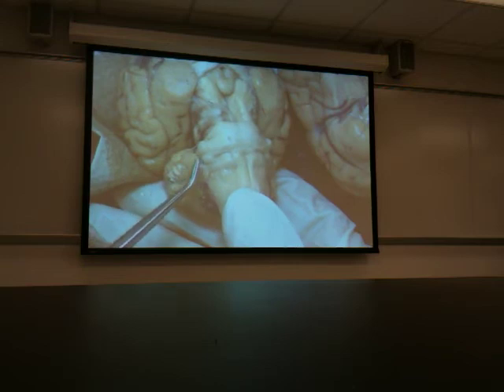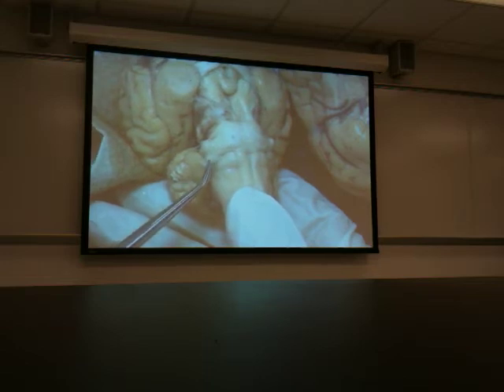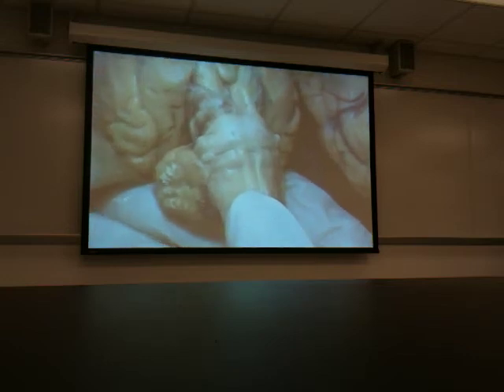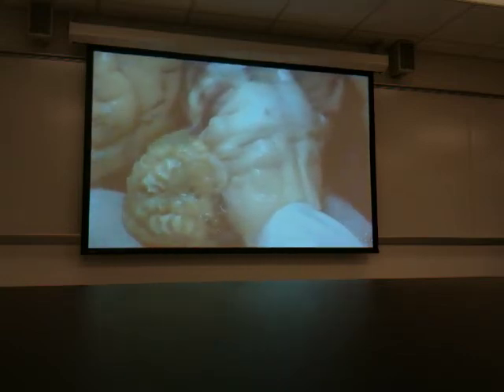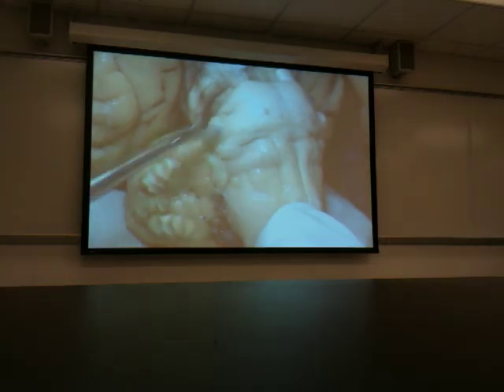This right here, look at this beautiful facial nerve. These are the rootlets of the facial nerve. Do you see them? You want me to zoom in further? Yeah. These are the rootlets of the facial nerve. And this is the trapezoid body, don't forget. That's the pons. There's your trigeminal nerve stump.